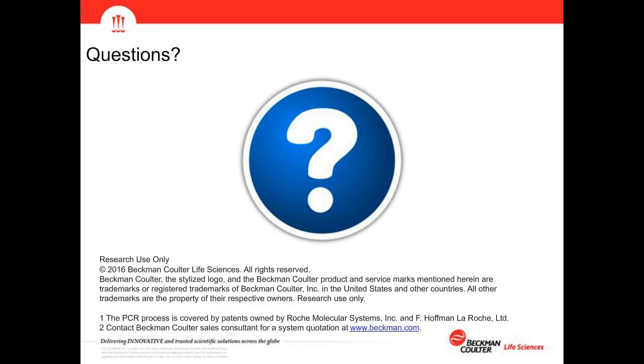And we also develop methods in-house and generate data, which are then validated with these vendors. And we also receive input from their side, what is important and what are the little details that need to be taken care of to get good results with their kits and chemistries. We're open, so we're not exclusive to anyone, and we will be in the future as well.